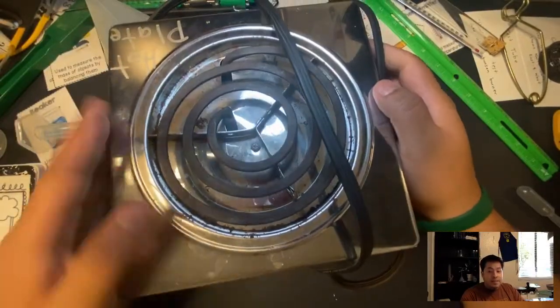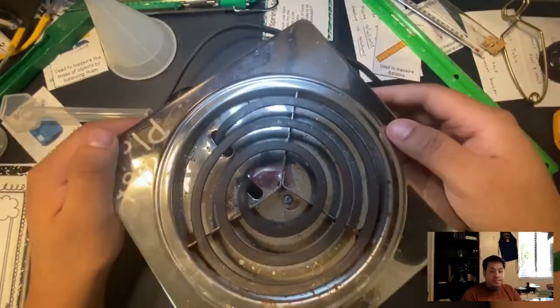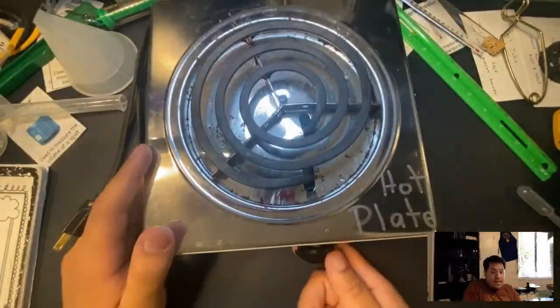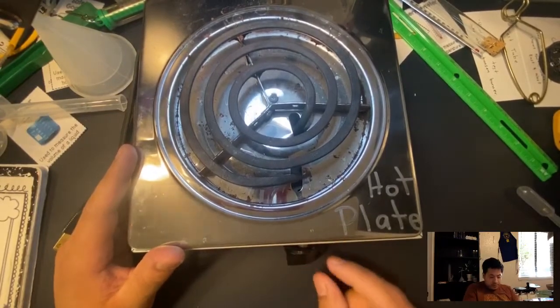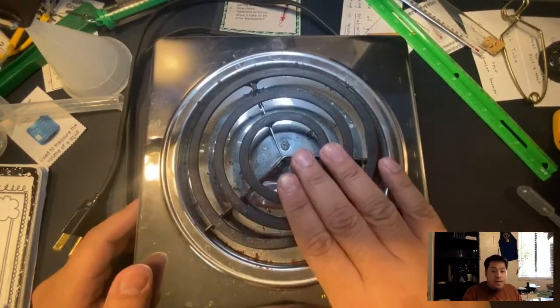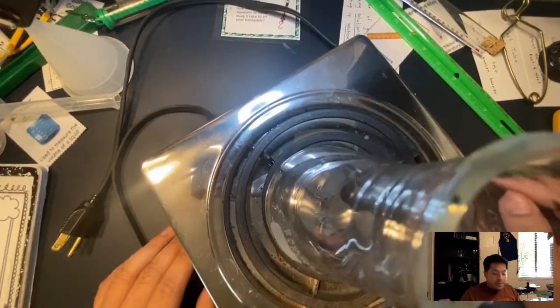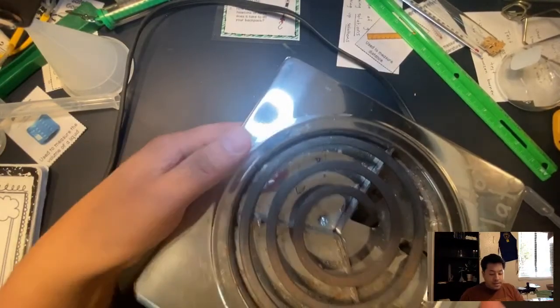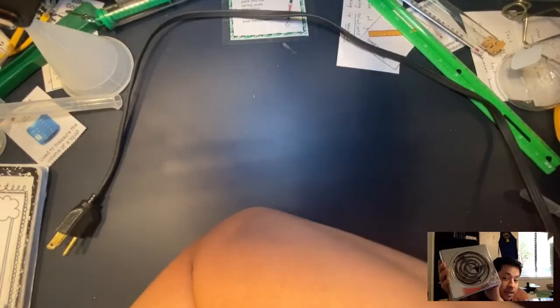Here is the hot plate. It looks like a stove, but it's a hot plate. It has a dial on the side that goes from low — number one — up to very high. You can put a flask on top to warm up different types of solutions or to boil something. We're going to be boiling things in the science lab.